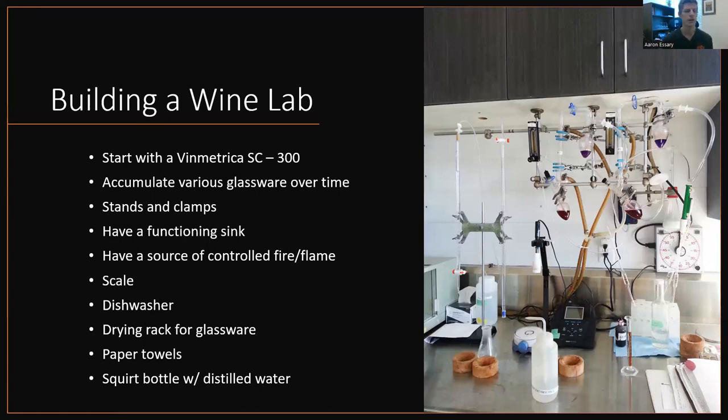After that, I would just start accumulating various glassware — beakers, pipettes, Erlenmeyer flasks, any and all kinds of chemistry glassware. You just slowly accumulate and figure out what you need. With that, stands and clamps, because you have to clamp the glassware to something and to each other. So stands and clamps are important.